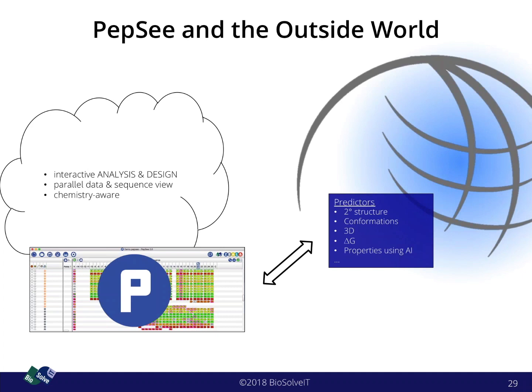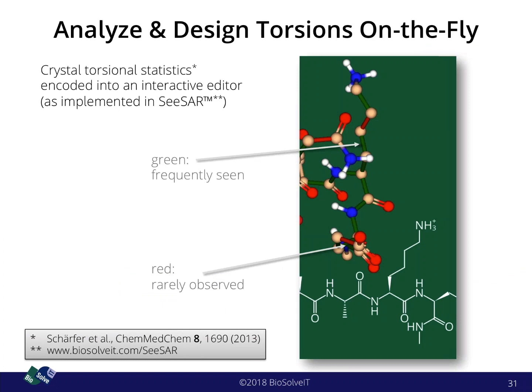conformation generation of at least parts of peptides, perhaps even work in 3D once we're in a lucky situation to have crystal structure information, or the Holy Grail using free energy approximations, or whatever kind of yields is being yearned for, that is, use all the sequence and data combinations that you may have to do machine learning algorithms with it, and develop methods that may well be coined as artificial intelligence methods.